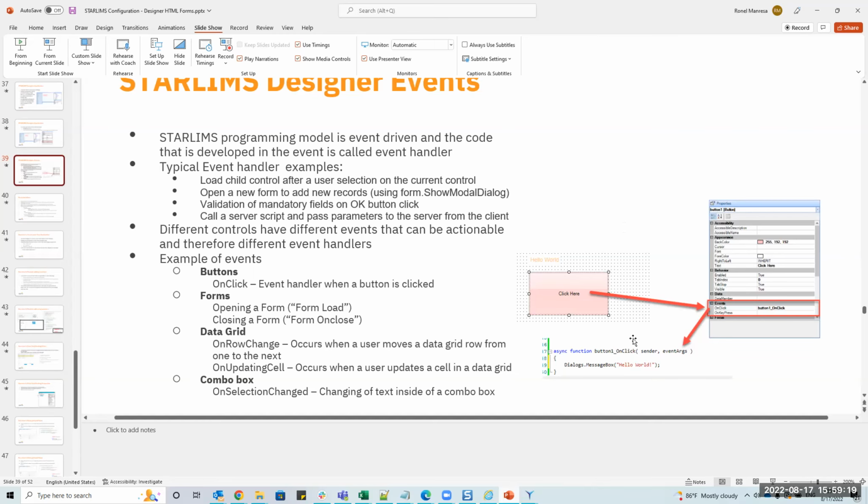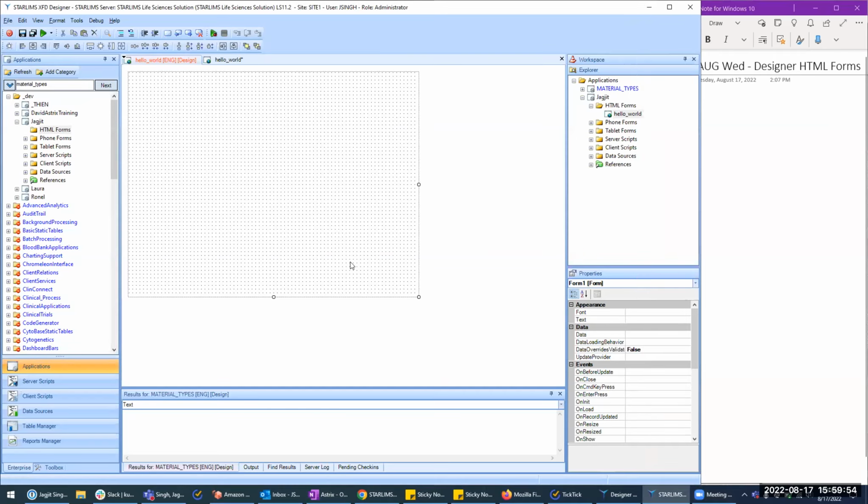So I'm going to leave this. How do we do this? I'll pick one of you and then the others can watch. Digi, why don't you go and let's just do this together. I can walk you through it and then you share. That way I'm not the only one sharing my screen here. Sure. I'm going to have the PowerPoint open and we're just going to watch Digi do this.